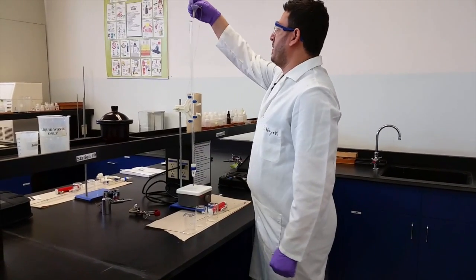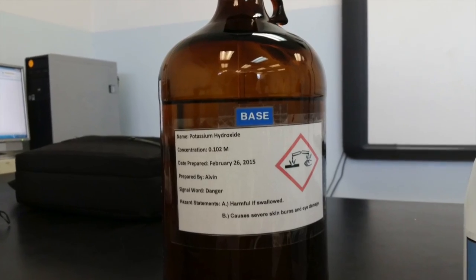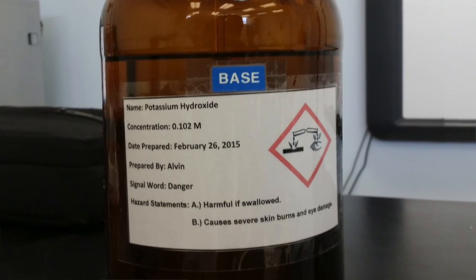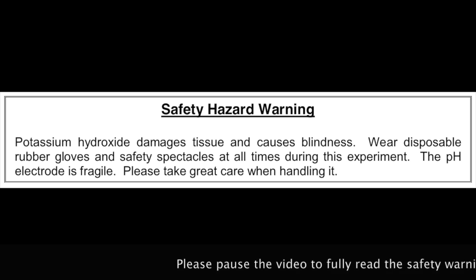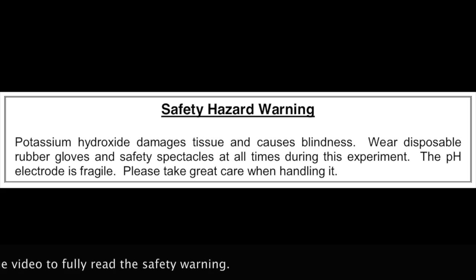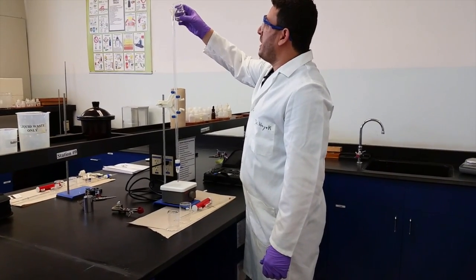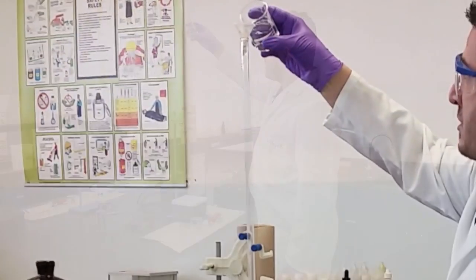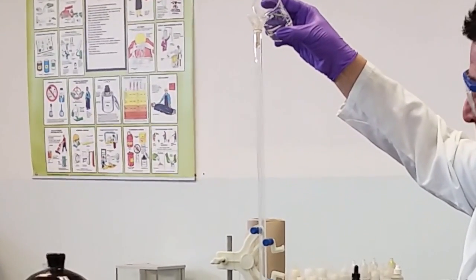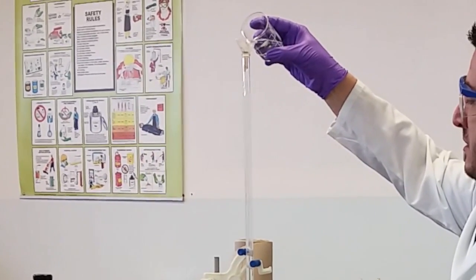Okay? Now the very first thing we want to do is to fill your burette with the base. So here we have the potassium hydroxide solution. It's a 50 milliliter burette, so you will need to take a little bit more, like 60 to 65. Now when you add your base to the burette, make sure that you don't have air bubbles inside the burette, so add it gently. You fill your burette with the base.